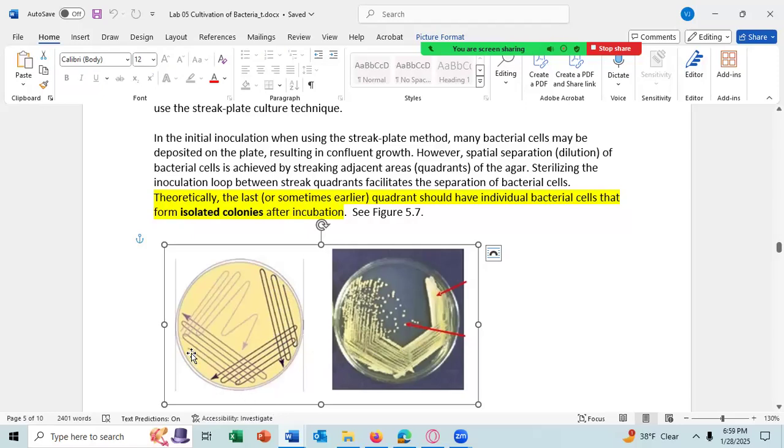They started over here. What's the problem with streak three is, once again, they went where the bacteria are very high and concentrated. You only want to go where the bacteria are more dilute. And you want to only do that 3 or 4 times. So you should stop right about there. Shouldn't come back here. And then streak it out.